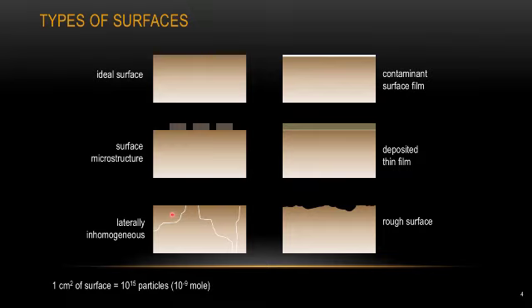For instance, the intensity of the XPS signal will vary according to its crystal orientation. Lastly, for people working on polymer samples or even biological samples, the surface of the sample will be quite rough. And for a very rough surface, you're going to get very noisy data compared to an ultra flat surface. So before you do the measurement, you also want to make sure your sample is compatible with the XPS machine, which we'll talk more about later.